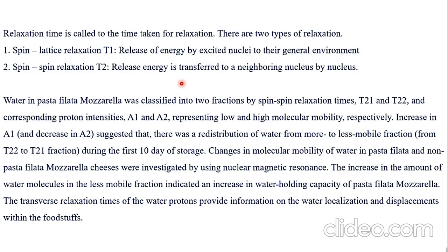Coming to the water in pasta filata mozzarella cheese, it is classified into two fractions, T21 and T22, corresponding to the intensities A1 and A2, which represent low and high molecular mobility respectively. An increase in A1 suggested a redistribution of the water among the fractions during 10 days of storage.